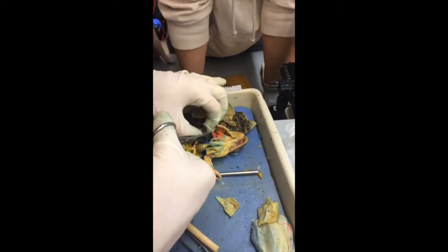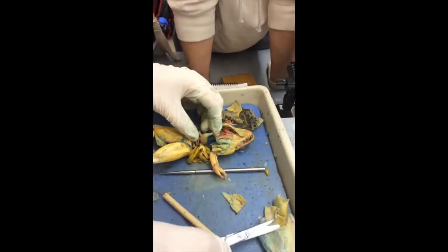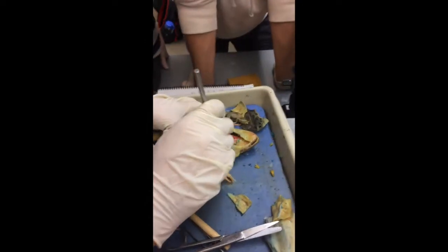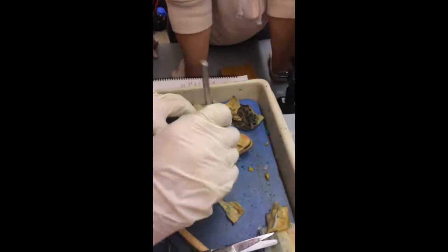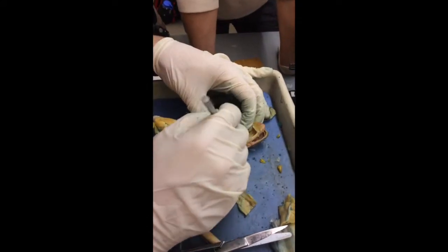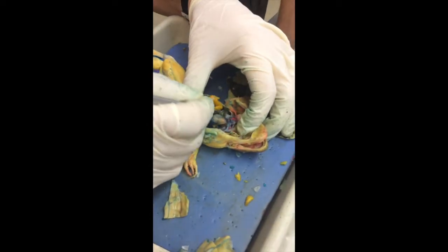How many chambers does the frog heart have? Three. Because the blood gets mixed with the other one, the non-oxygenated blood. Oxygenated and non-oxygenated. Yes. Okay, so the heart here, you can see this is the heart.